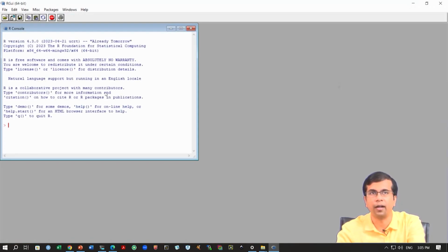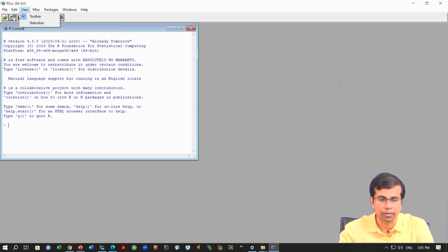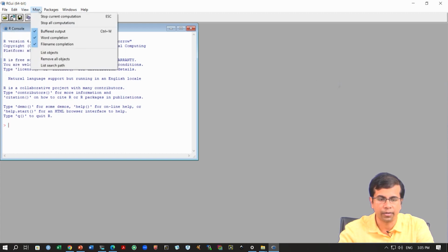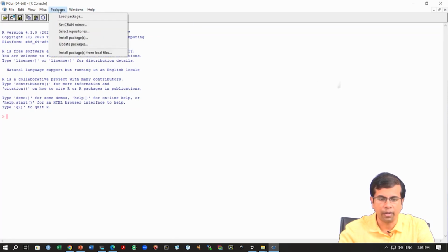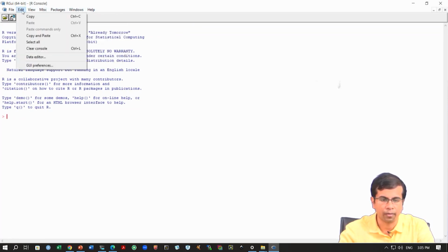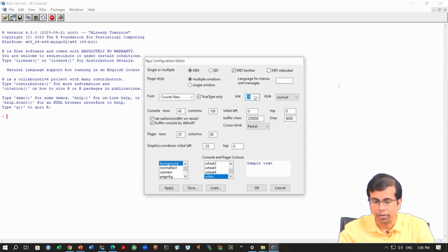Okay. So, this is the R, I have it installed, this is 4.3.0, and I will run everything from inside here. Okay. I can probably zoom in a bit, let us see, I can make it slightly bigger I think, and then we can probably see this better, and here it is, right.